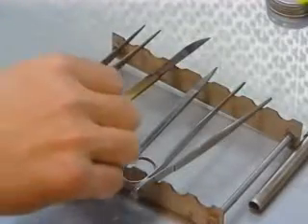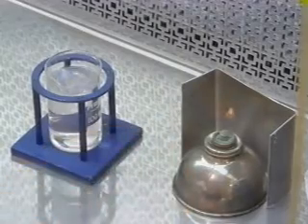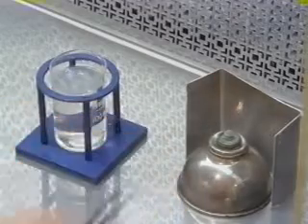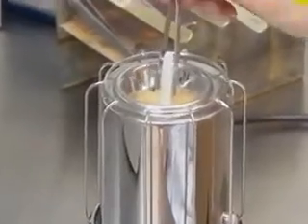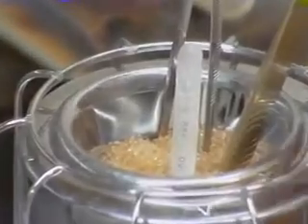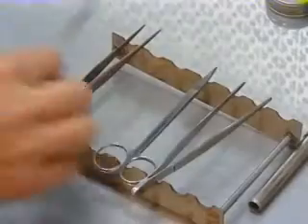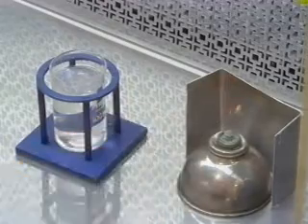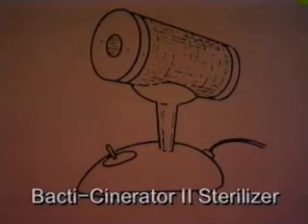All dissecting instruments need to be sterilized in between cuts. To do that, we can flame them in 70% alcohol and then allow them to cool. Or we can use a bead sterilizer like this one here. The bead sterilizer heats a series of glass beads to 250 degrees centigrade. We only need to insert the instruments in them for about 5 to 10 seconds to kill any microorganisms which may exist. There is other equipment used for this purpose, for example, a bacticinerator.